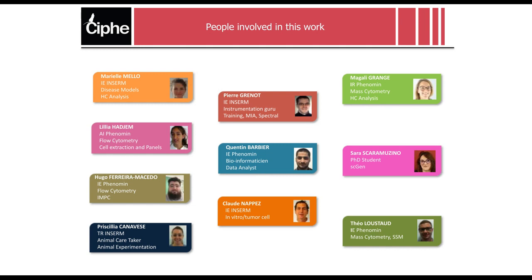And last but not least, within the CIPHE team, I often ask my collaborators to share their just acquired data, when there is something really burning that we never looked at, so that I can have a look at it too. In a remote manner, if I'm traveling, I can even look on my phone and then give suggestions or advice from what I'm seeing, and that keeps you in touch with the data that is being produced wherever you are. So this is very, very nice capability too.